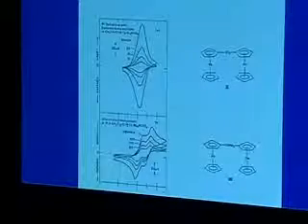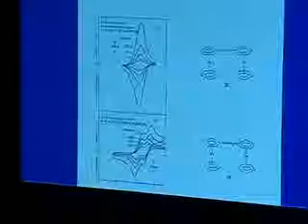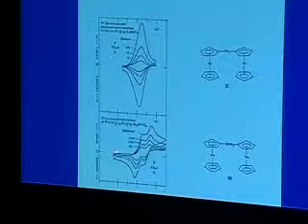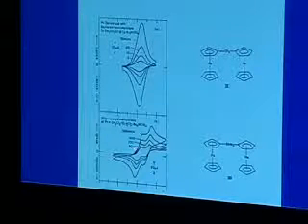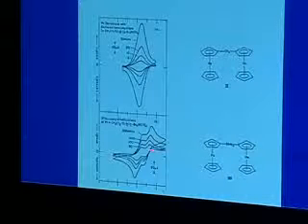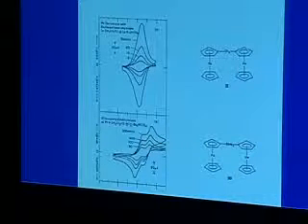However, what do I do when I have something like this, where those peaks are coming almost on top of each other? Clearly, there are two peaks there. There's no question about that. But equally well, it's clear that the error in measuring this peak current, if I were to measure it off baseline, would be horrendous. And likewise, I don't have enough of this peak showing that I know exactly how to sketch in the baseline here.